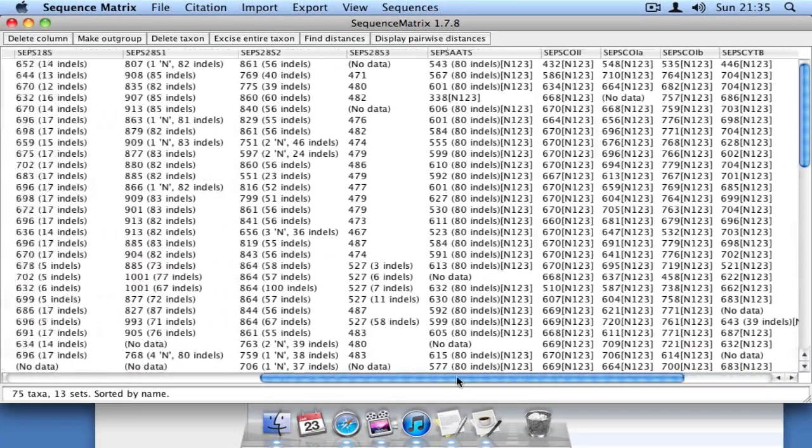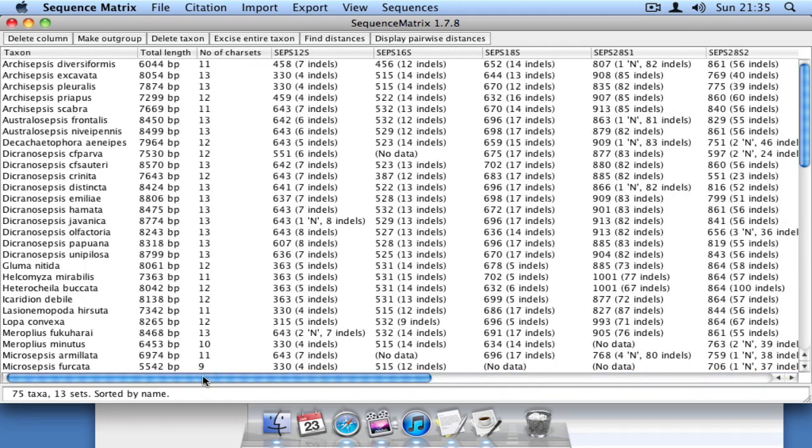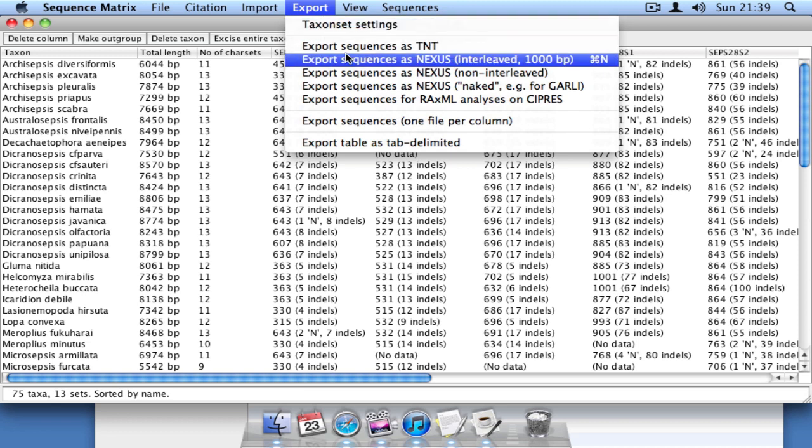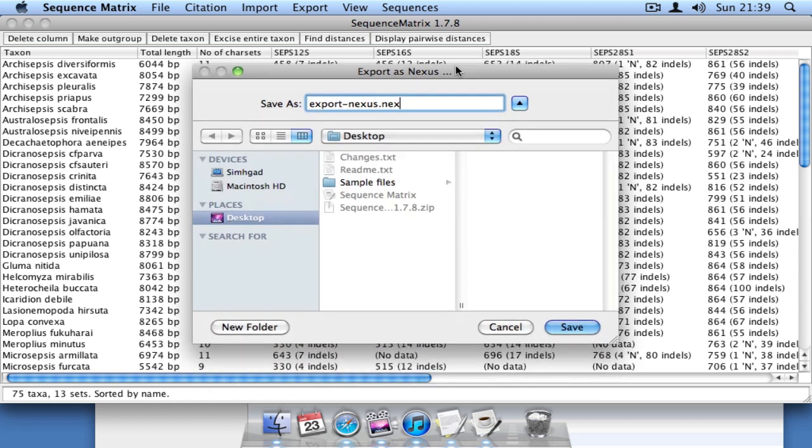Now that we've finished concatenating our data file, we can export it by clicking on Export and selecting our format of choice. I'm going to export these data as an interleaved Nexus file. I'll name the file and then select an export location.